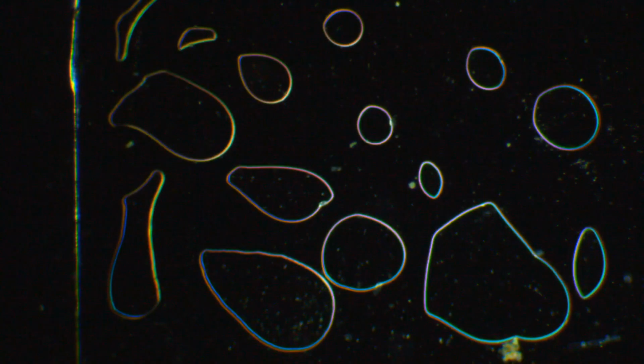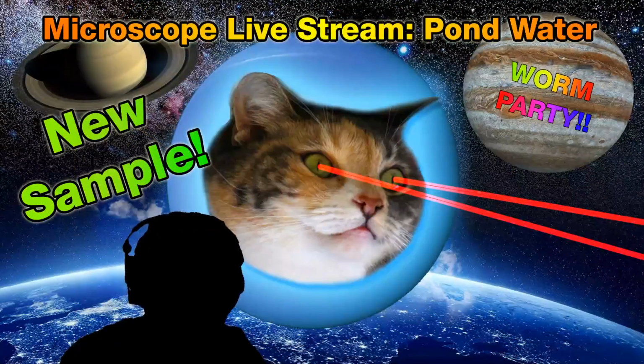I know I can put the drops from the sample on a depression slide and see rotifers, based on last night, assuming they're still going. Okay. Well, not much there on that one.